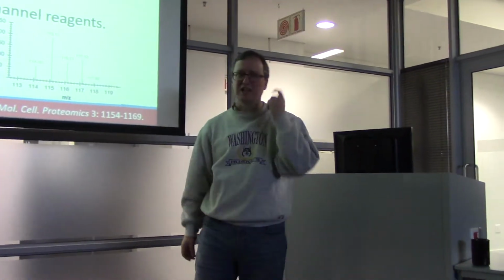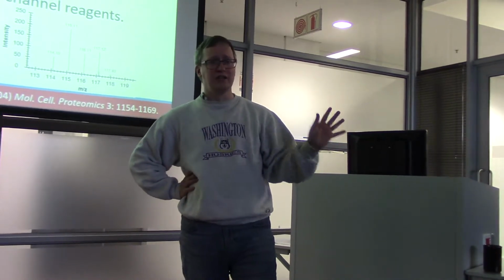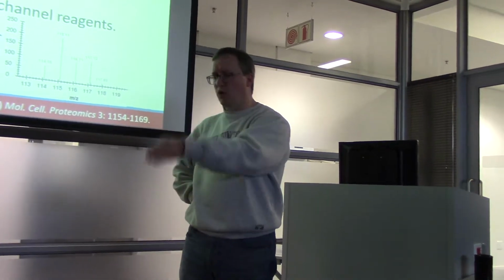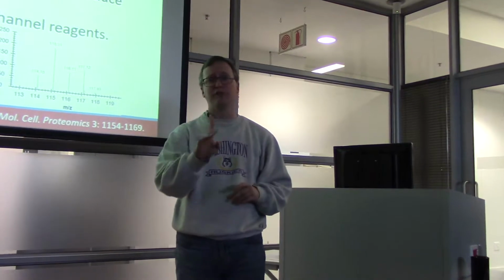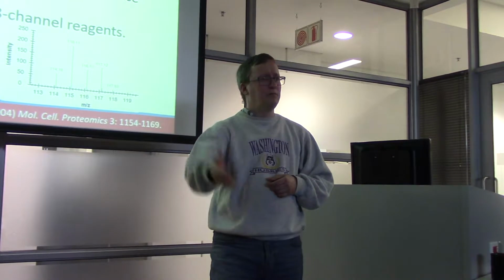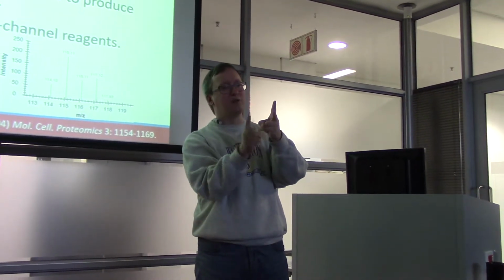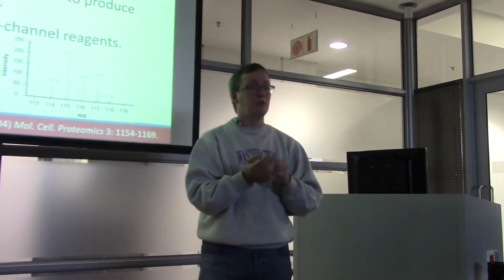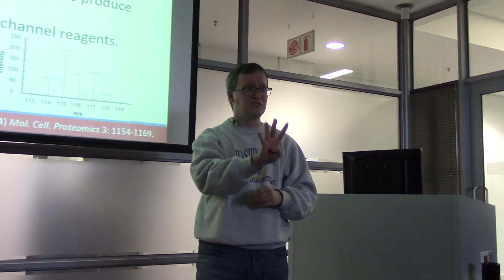So in an iTRAQ experiment, you do not count on having introduced any label at all into the sample cohorts. So imagine that you have sample cohort 1, sample cohort 2, sample cohort 3, sample cohort 4. These could represent 4 different time points, or they could represent different stimulations, right? So our friend right here just had an experiment with 2 different species combined with 2 different levels of water supply to these 2 species. So that 2-factor experiment translates into 4 cohorts. Did everyone see that part?